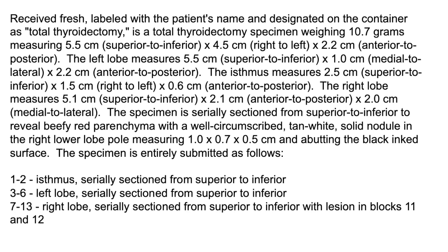Once again, here is the final gross description for the specimen you just watched.